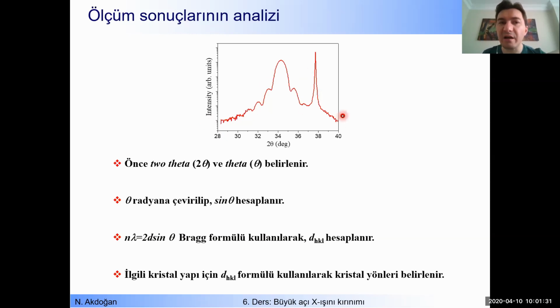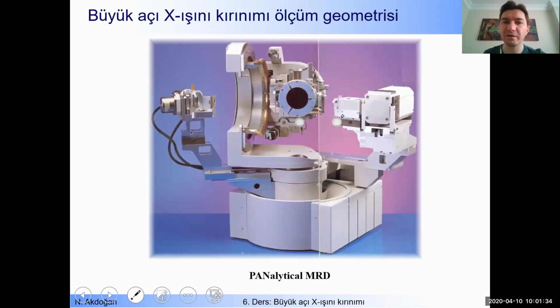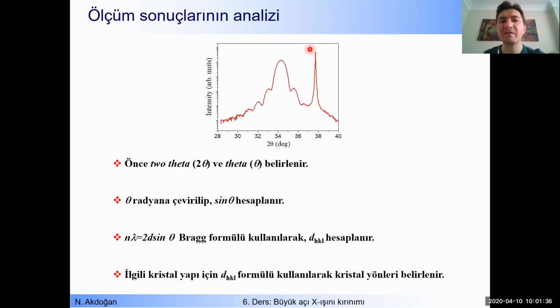So how to analyze that signal? This is very important. This measurement takes more or less 1 hour, okay? It depends on your needs. It depends on the range, okay? So within 1 hour, or this alignment within, let's say, half an hour, you get that type of signal. But what do these peaks, this intensity, those angles tell you, okay? So what is the information here? How to get that information? Now I will show you.